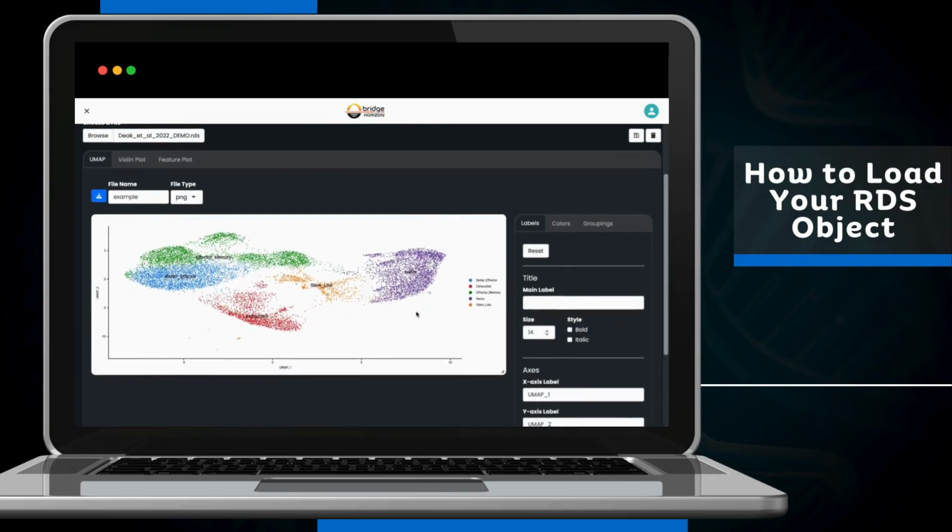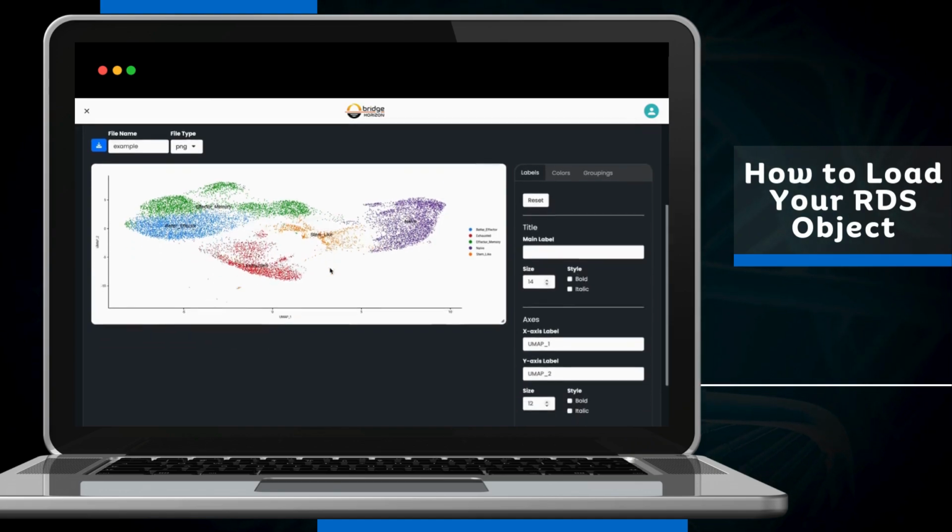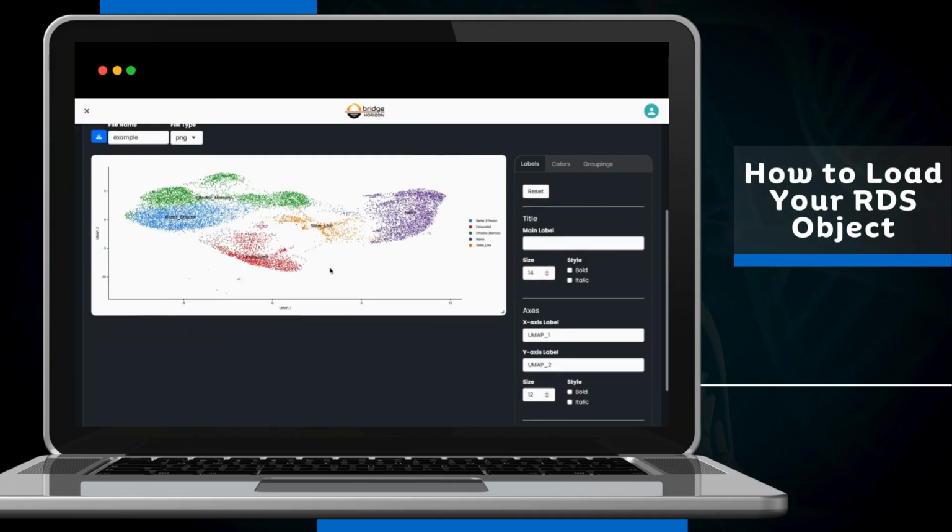Excellent. Once your RDS objects have loaded, you will see that the UMAP will be immediately visualized as shown right here.